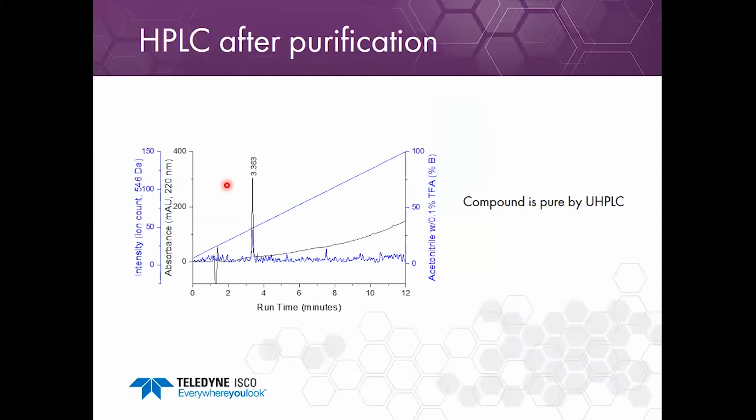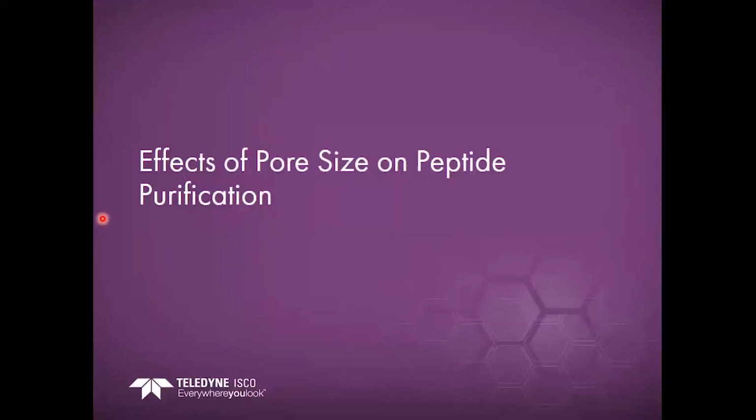After purification, here's my analytical HPLC. Both UV and mass spec line up, and there's nothing else in there. The peptide is nicely purified. The next thing we will talk about are the effects of pore size on peptide purification.